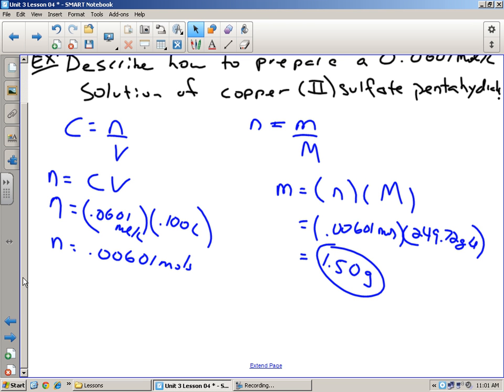And they come in small, and of course they would come in bigger ones too. So for industries, you're not going to make a liter of stuff. You're going to make 1,000 liters of stuff. So you're going to have really big volumetric flasks. Okay. So there's wide varieties, but they have specific volumes for each one of those, and they only do that volume. That's all they do.